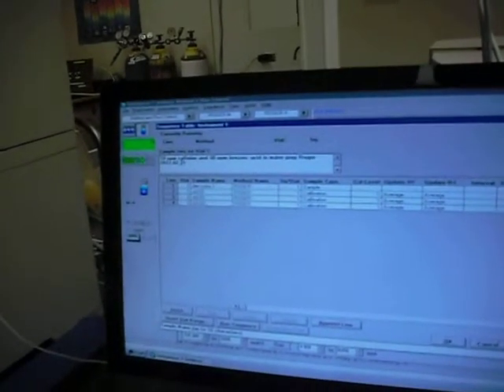Standard 1 might be 10 ppm caffeine and 30 ppm benzoic acid in water. Something like that. That could help.